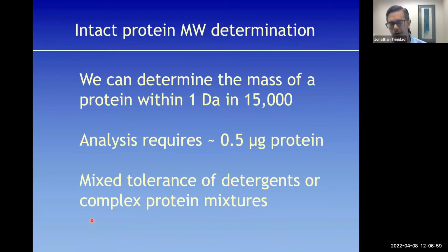All right. So we have a lot of protein biochemists on campus, and they're often just synthesizing recombinant proteins, and they just want to know the intact mass analysis. So standard LCMS, really simple gradient, and we deconvolute the data and get them the intact mass. It's a fairly accurate process, about 1 Dalton in 15,000 sort of error.